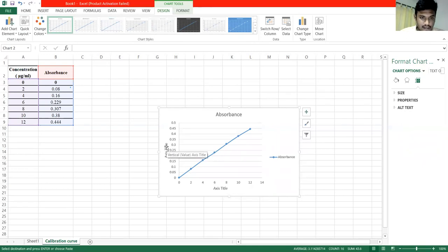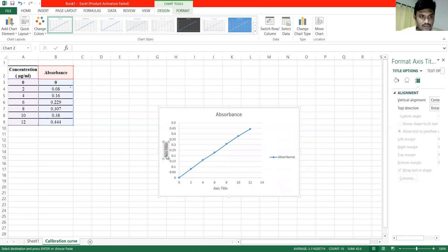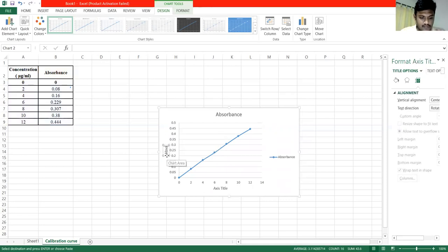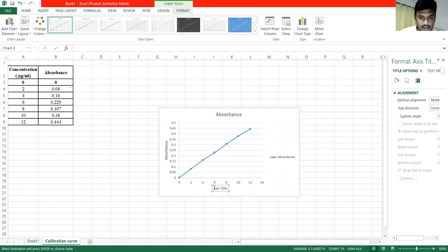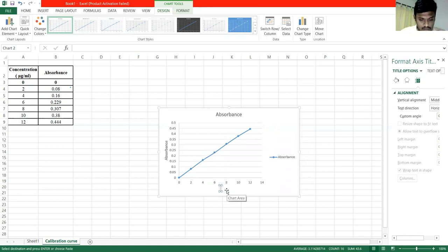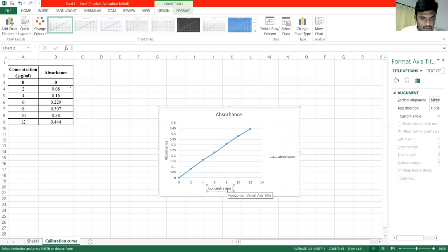You will label the X-axis and remove the default title. This will set the Y-axis to the Absorbance values. In the X-axis, you will type the Concentration label in the microgram parameter.